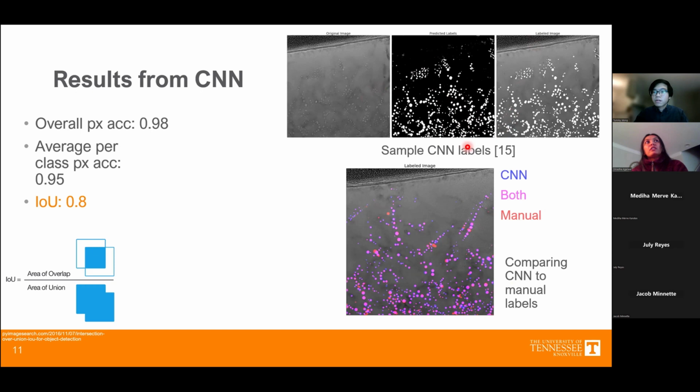Distance loss functions are based on, for an object, defining the center, and from the center you define the boundary. That kind of loss function really optimizes the boundaries of your objects. I would share a paper with you after this. But nice presentation. Thank you.